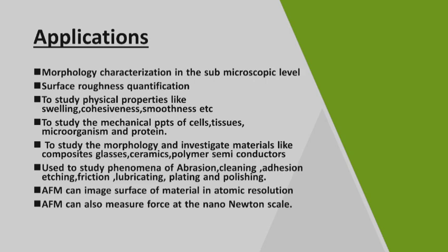It is used to study physical properties like swelling, cohesiveness, smoothness, and in case of biological samples, to study the mechanical properties of cells, tissues, microorganisms, and proteins, and to study the morphology and investigate materials like composite glasses, ceramics, polymers, and semiconductors.